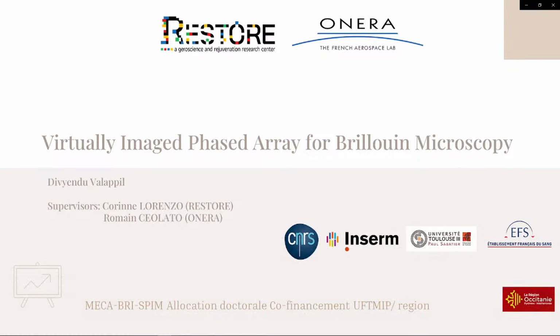I will be speaking about the virtually imaged phased array for Brillouin microscopy. I'm Divyendu Valappil, and I'm currently a PhD student with Restore Labs and ONERA. And my PhD topic is Brillouin microscopy to analyze biological samples and aerosols.